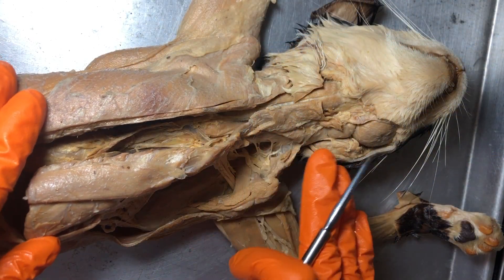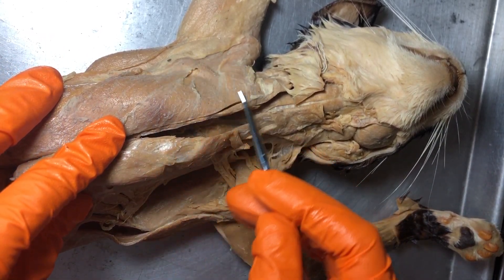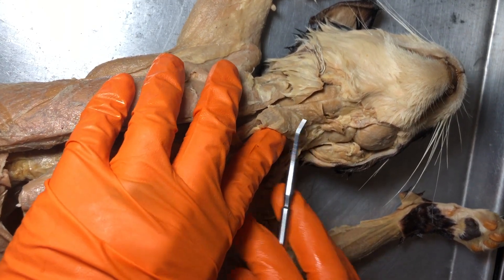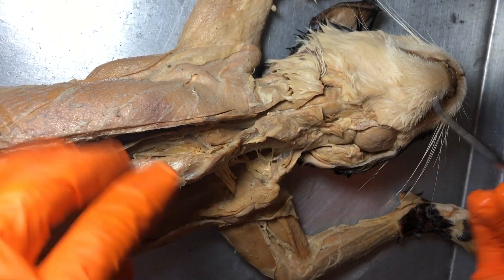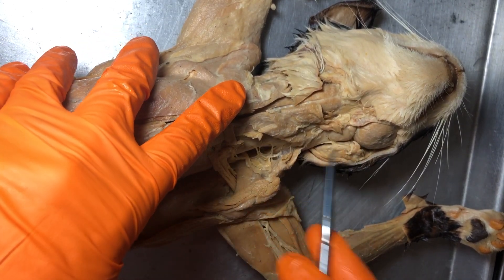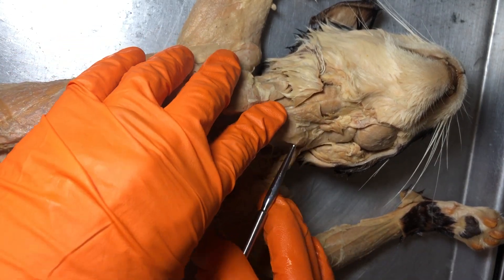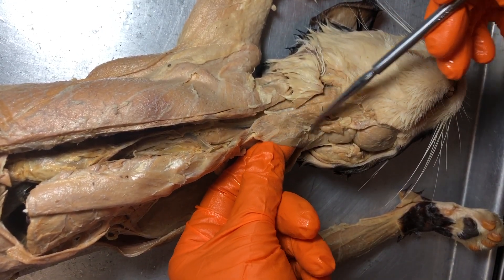Up towards the anterior part of the kitty, here we have the large pectoralis major — this would be the right pectoralis major. This muscle right here is actually called the sternomastoid, which is different from us: where we have a sternocleidomastoid, this muscle only connects to the sternum and the mastoid process on the cat. In humans, sternocleidomastoid means it connects to the sternum, clavicle, and the mastoid process — that's another difference you should be aware of.